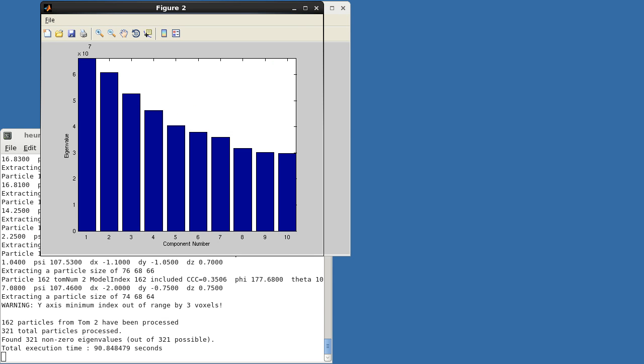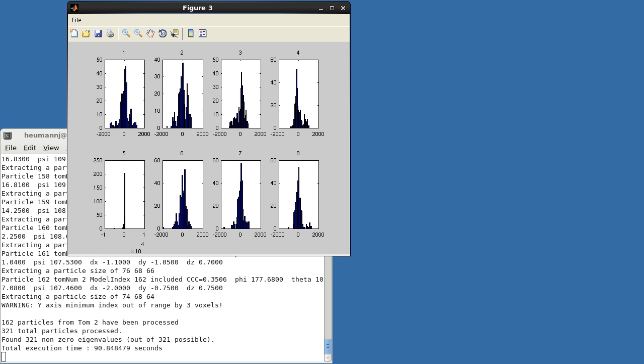Figure 2 is similar, except that it shows a bar graph with heights proportional to the fraction of the variance explained by each of the first 10 features. Finally, Figure 3 shows the distribution of coefficients that result from projecting all of the aligned volumes along each of the first eight components. Here, you look for distributions with multimodal peaks or interesting structure. These are especially promising for clustering.